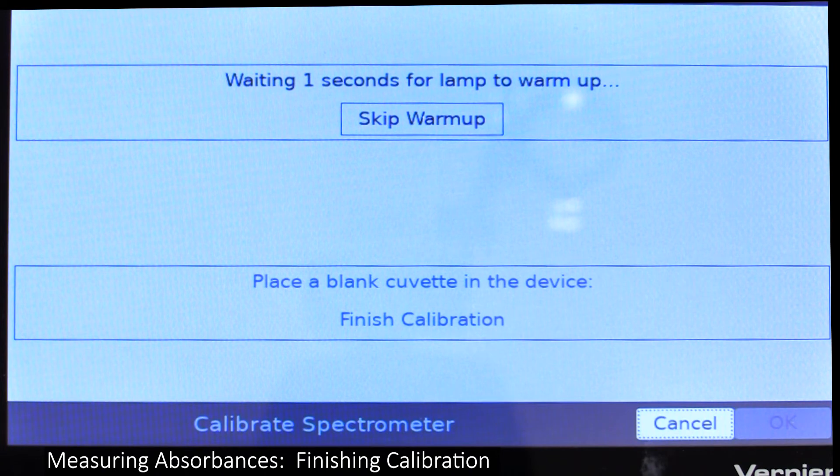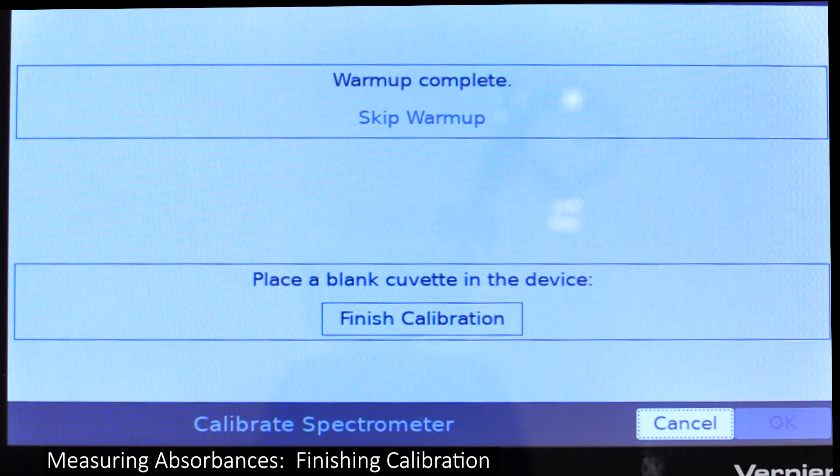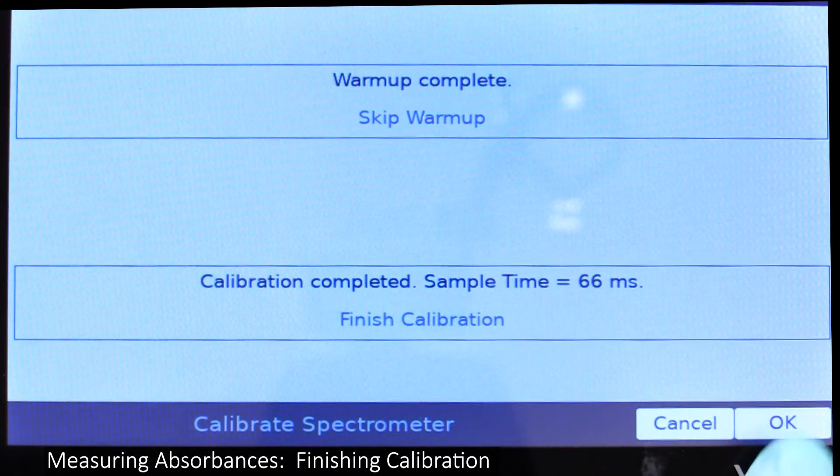As soon as the lamp has finished warming up, finish the calibration by pressing finish calibration, then click OK.